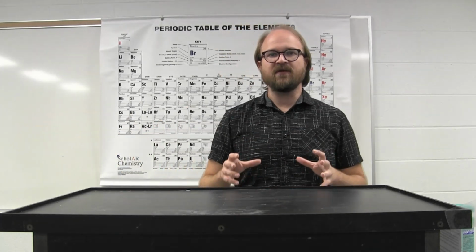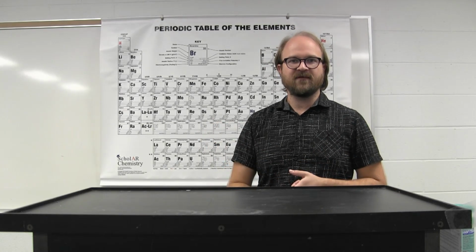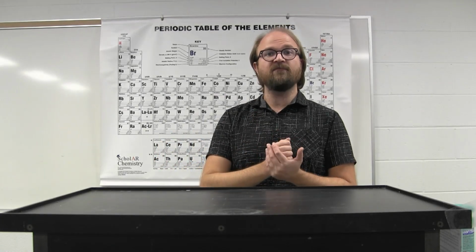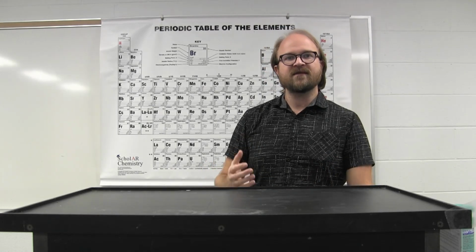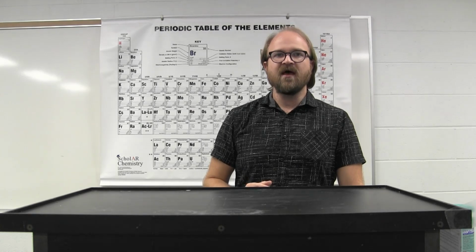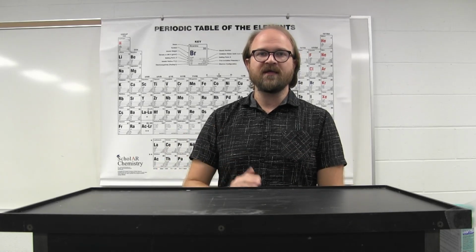And this experiment looks at how to determine the limiting reactant, both in theoretical ways and calculations to determine the limiting reactant based on the sheer number of moles that are available in a situation. And the experiment itself also looks at determining the limiting reactant based on experimental observations, looking to see, based on experiments, what is the limiting reactant.